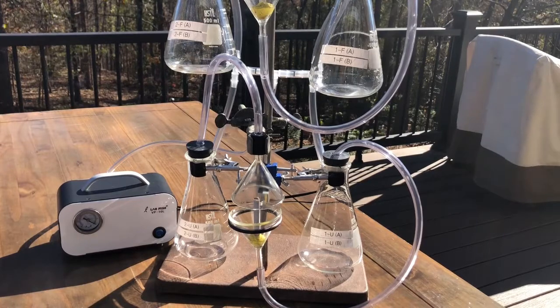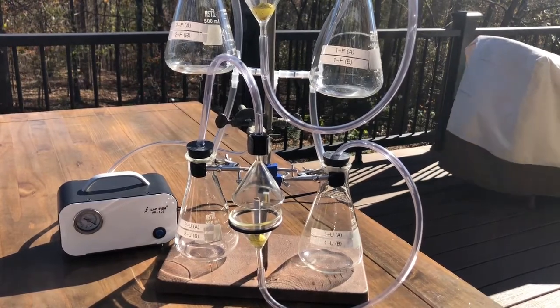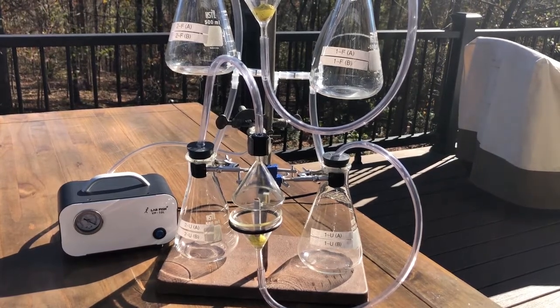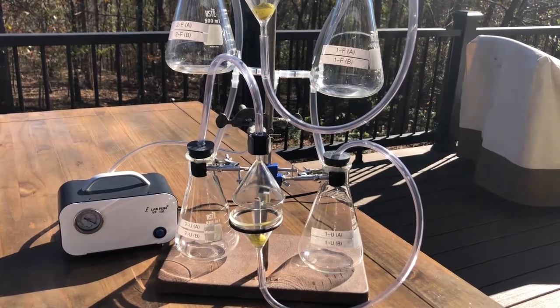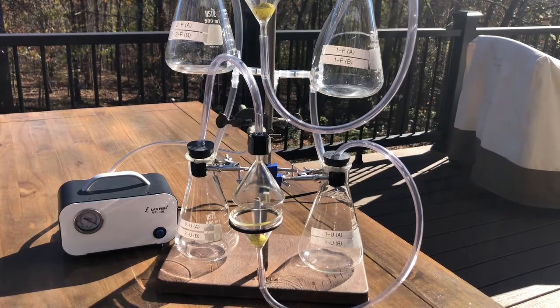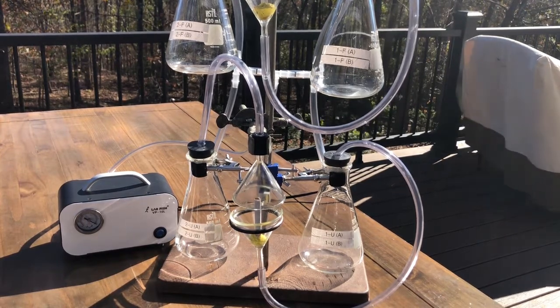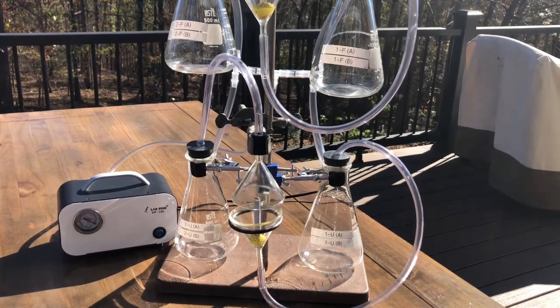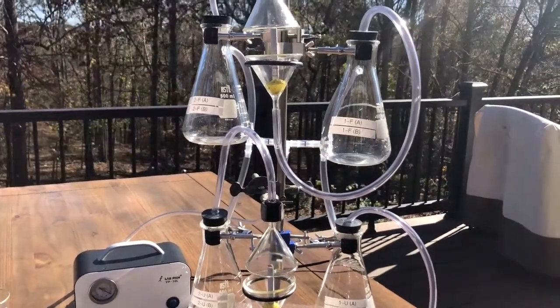Okay, I just had to do some fairly significant re-engineering. I could not get the cigarettes to sit up straight, and there wasn't a good seal, so the vacuum suction wasn't doing its job of burning the cigarettes down. So what I did is I put a little modeling clay around the base of each cigarette. I actually got new cigarettes, I remasked everything, I have all that data. And I really squashed on those rubber stoppers to make sure they were in there nice and tight. So now we are going to try it again and see how we do.